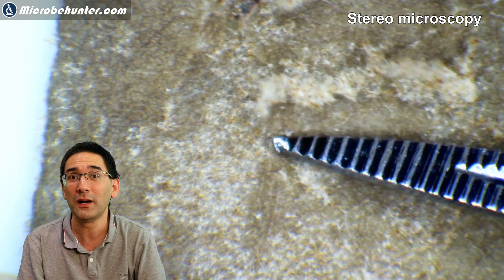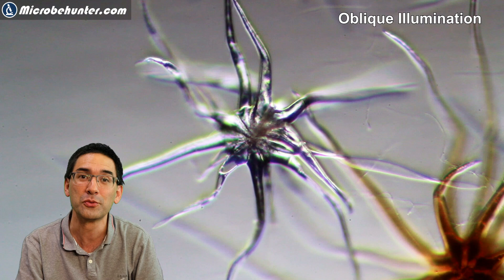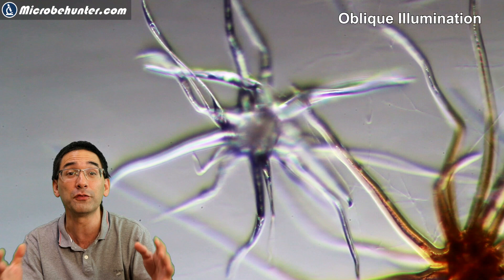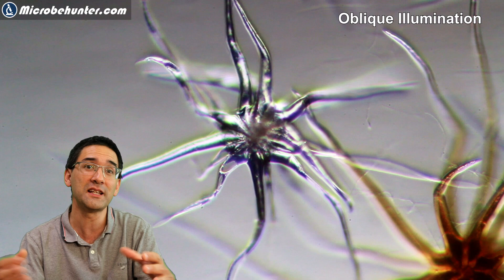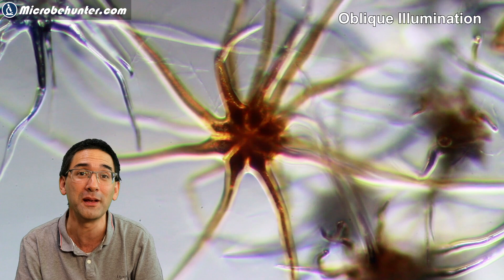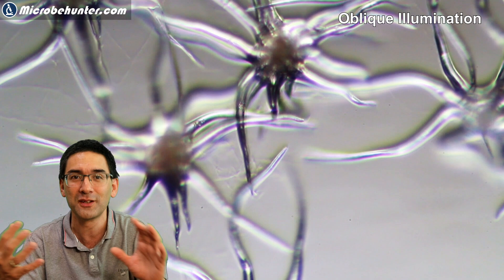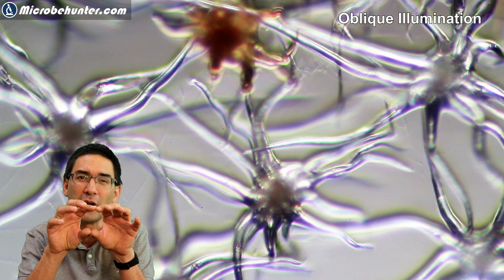The best way to observe trichomes, besides the stereo microscope, is under a compound microscope. This image here is in so-called oblique illumination — one of my favorites — where light strikes the object from the side, casting shadows and giving it a slightly three-dimensional appearance. Using different illumination techniques emphasizes different parts of the structure; here we can see the central part much better than in brightfield microscopy.